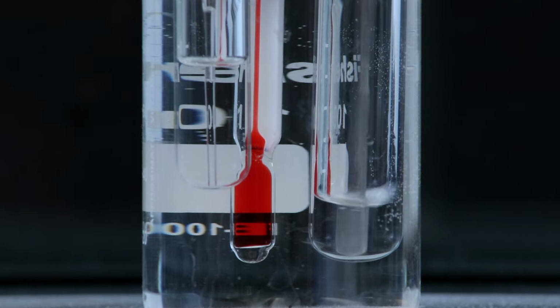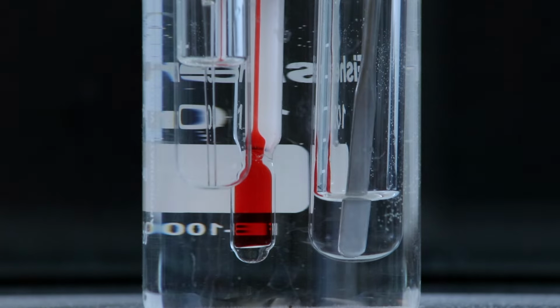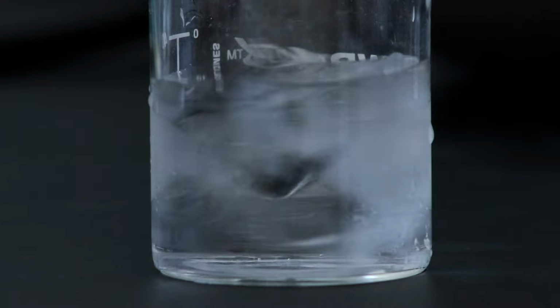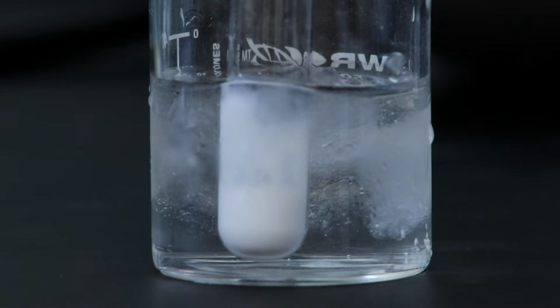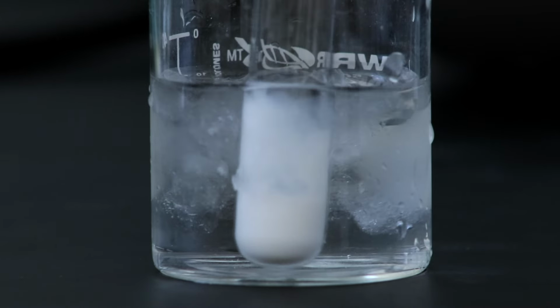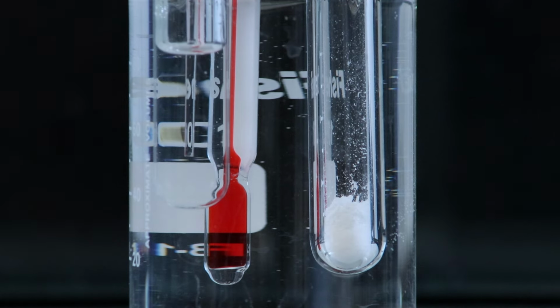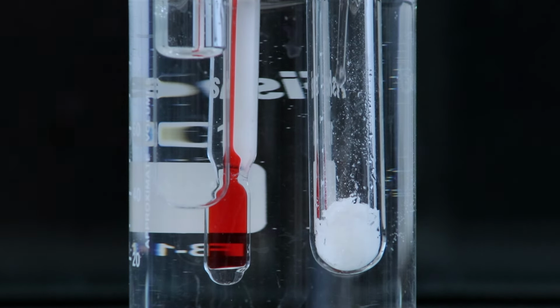And it looks like it did get there eventually. So now I'll test that it can come out of solution in an ice bath. And that worked great. It looks like ligroin is the solvent of choice for this alcohol, so I'll go ahead and add the rest of the unknown alcohol to a Craig tube and begin dissolving it in ligroin.